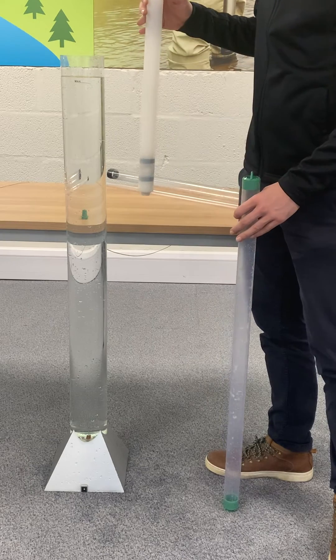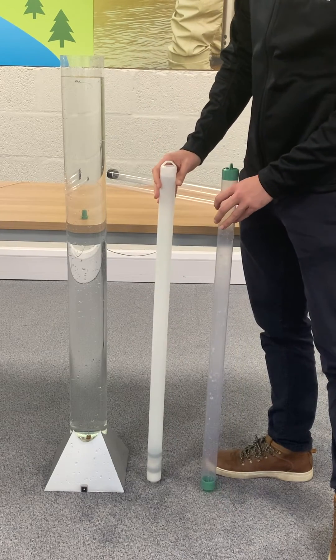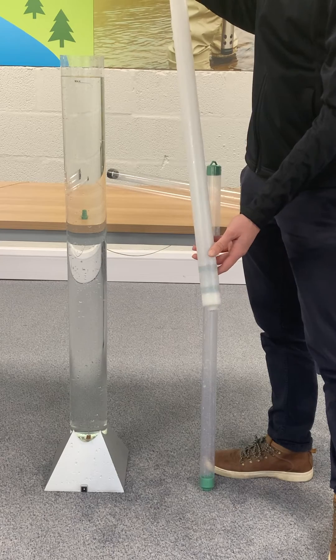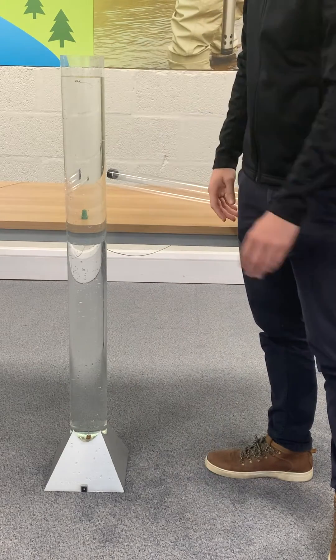They are most commonly made from naturally weighted PVC, but you can also get PE balers which need to have a weight in them in order to sink into the water. Most of the plastic balers are disposable and biodegradable. Stainless steel reusable balers can also be sourced.